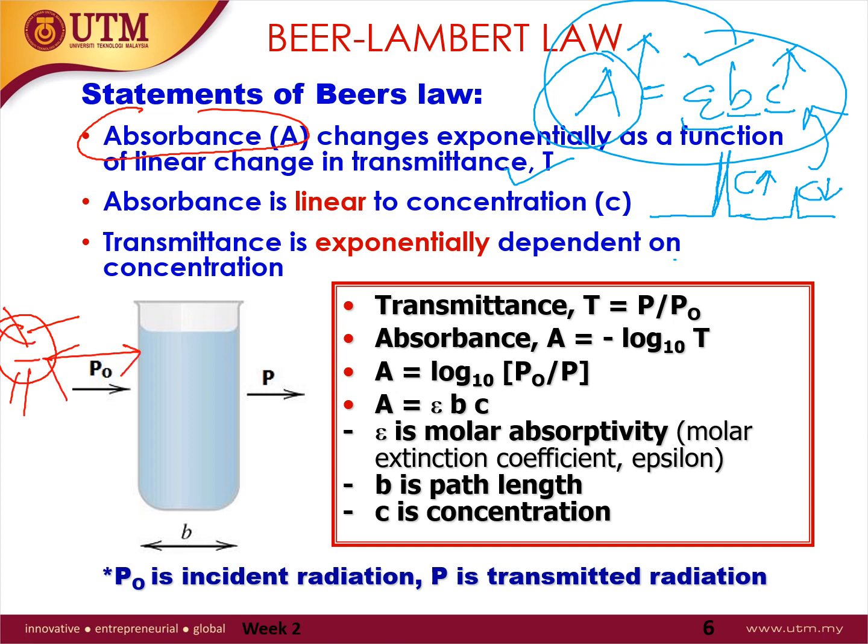Bombard means, what is the Malay word for bombard? Dikenakan terhadap sampel. And then all your sample inside here will absorb. Why do they absorb? How do they absorb? And what are the chemical elements that make them absorb? We will learn in UV-Vis later.